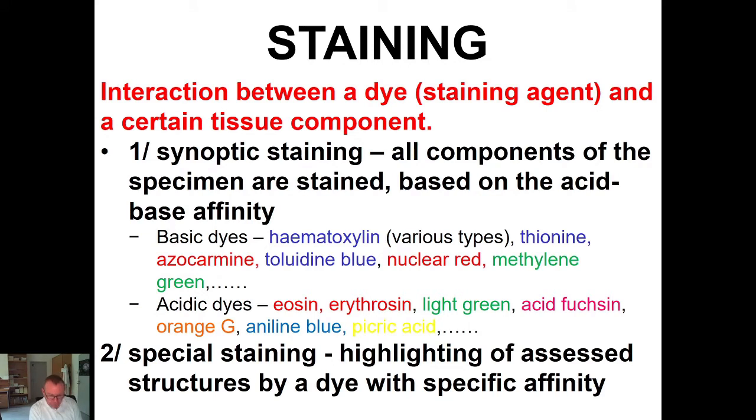And now we are at the end of the part of my lecture where everything was almost common for light and electron microscopy. It was possible to speak about both microscopies together. There were just small differences, or sometimes procedures were the same, like dehydration can be really the same for light and electron microscopy, or other steps as well. Now, staining is possible to use only in light microscopy. The reason was already said. Only light microscopy can show colors.